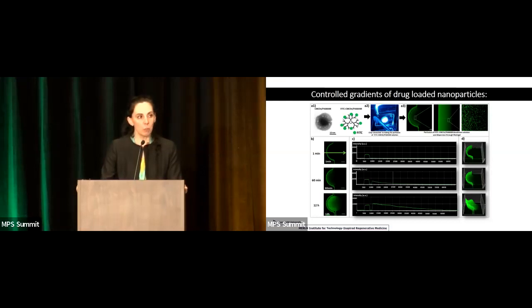And here we can also play with the size of the chip. This was relatively small, but you can also control these kinds of parameters quite easily and assess the diffusion of these particles inwards, as well as the specificity into the tumor cells, to attach to the tumor cells, and how the viability of the cells is affected by these drugs.